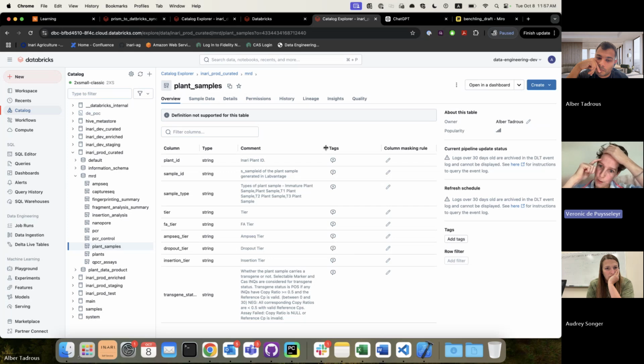But it causes issues if you want to, for science, have it. That's very, very hard to accomplish. You understand? Yeah, there is a huge difference in the process or workflow between science and product. And this setup fits the product workflow, right? It fits the product workflow, but it also doesn't fit you. No, and I also do not agree that it's information that should be stored at the plant sample level. There are many arguments against that, I think.